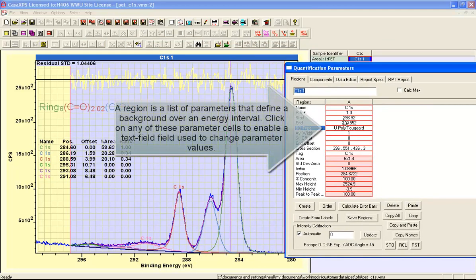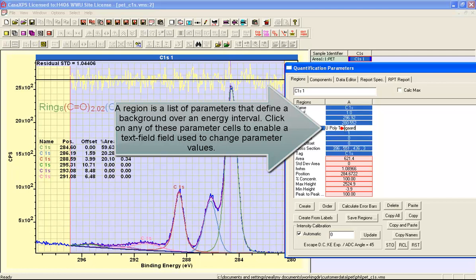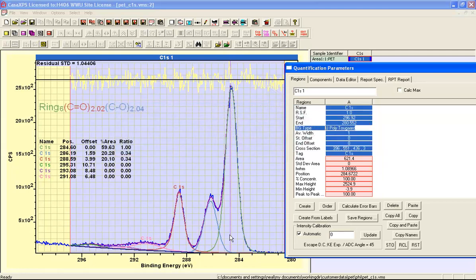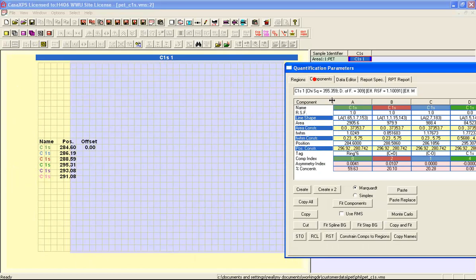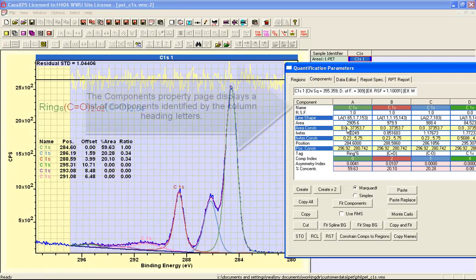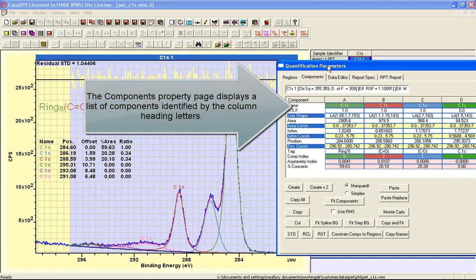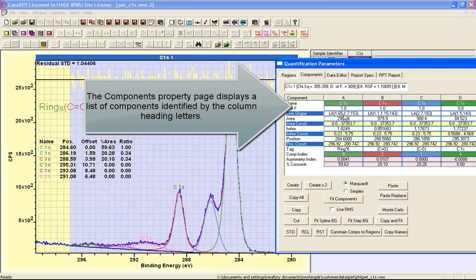The first table that we see is the regions property page and this is defining a background that is part of the peak model.